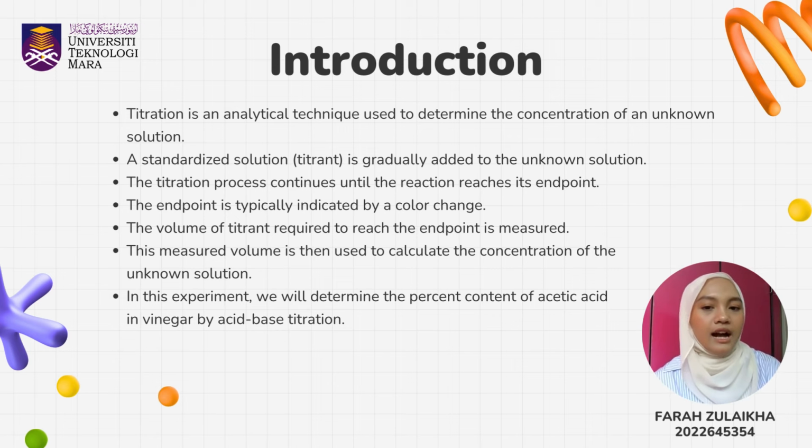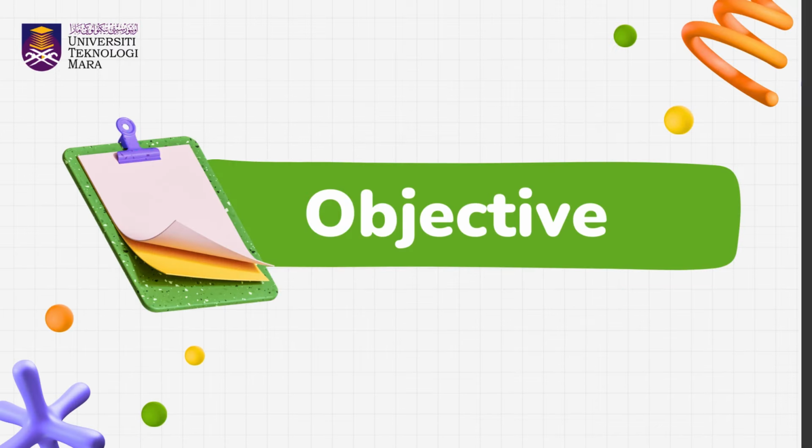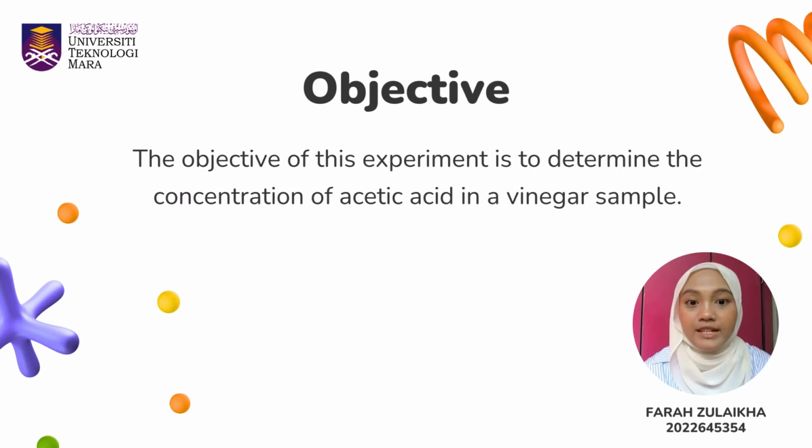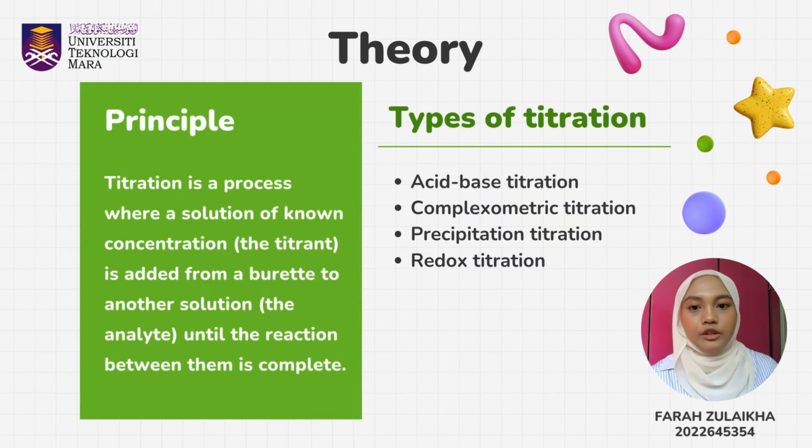So, today, our group will conduct an experiment to determine the percent content of acetic acid in vinegar by titration. The objective of this experiment is to determine the concentration of acetic acid in a vinegar sample. Now we move to the theory.